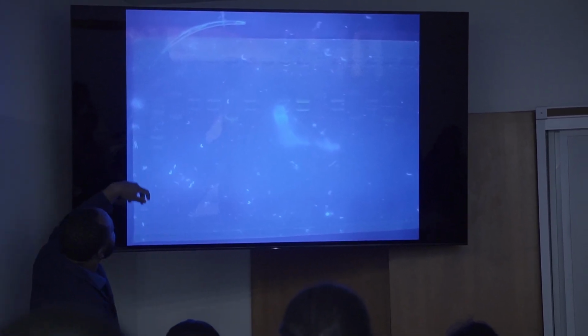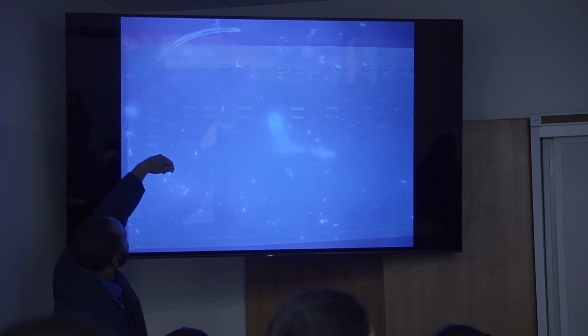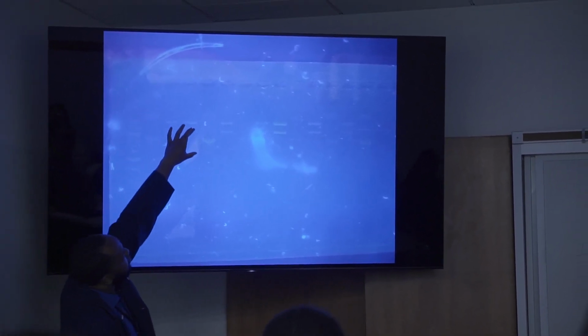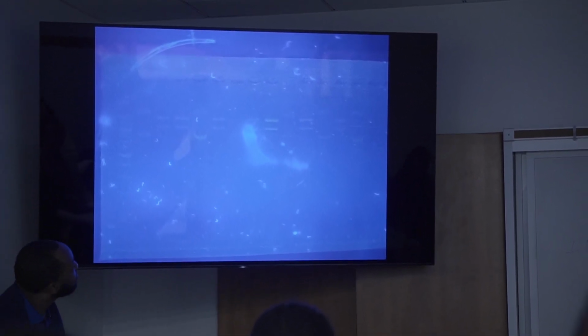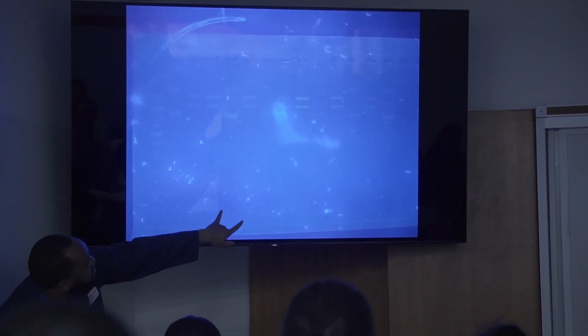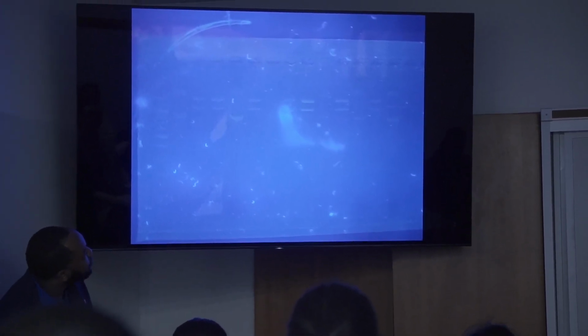The ladder is a little blurry as well, but you can see on the PCR that it looks like we have bands above and below. Y'all see that? Yeah. I see it at least. On most of them it actually looks like it lines up, on 16 and 14 too.